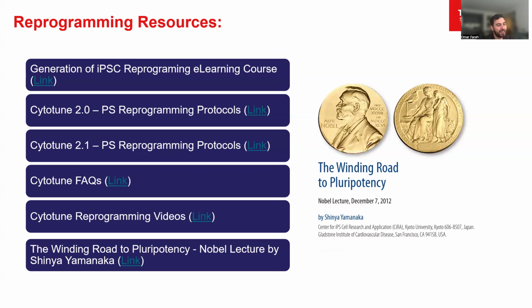I don't know if Catherine or Kitai, you guys also have any other input here. I don't know whether it's easier or harder to work with ESCs or iPSCs. I would say it's very line dependent. There are some ES cell lines that are robust that I've been working with for a very long time, and there's some really easy iPS cell lines that I've also worked with that are amazing. But on both ends, there's also lines that I don't even want to think about anymore. Yeah, I also think they are identical at this point, like for our purposes. So whatever is easiest to work with is best to work with, I think.